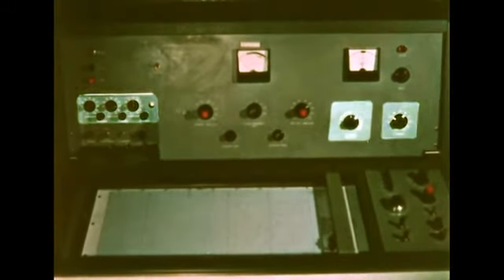The first group controls the magnetic field homogeneity. The second group controls the intensity of the radio frequency field. The third group controls the receiver and the spectrum amplitude. The fourth group controls an electronic integrator for measuring peak areas. And the fifth group controls the recorder.